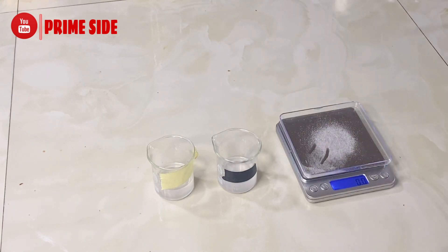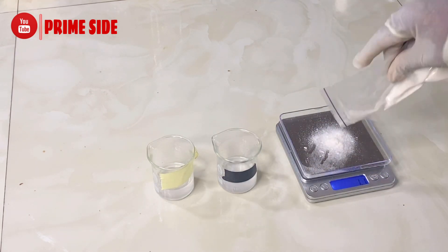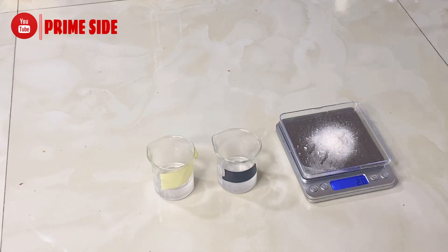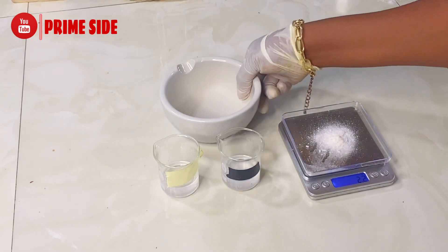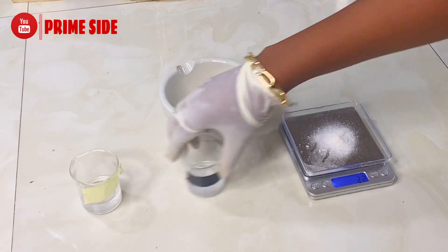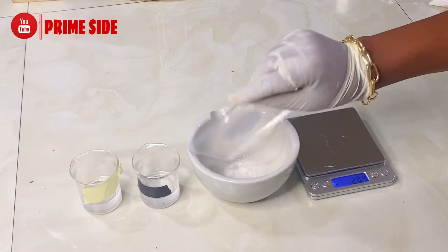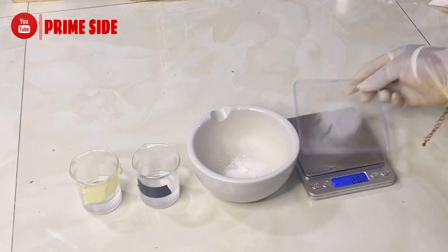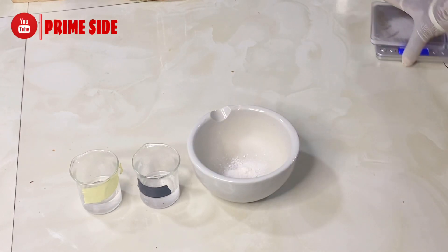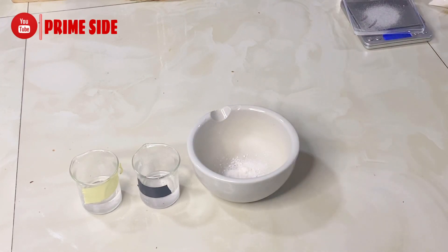So after 10 minutes, I'm going to measure up another five grams of salicylic acid. This time I'm going to be introducing a porcelain mortar. Here I'm going to crush my salicylic acid in a porcelain mortar till it's a fine powder.